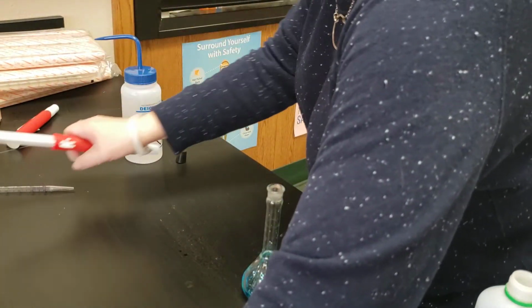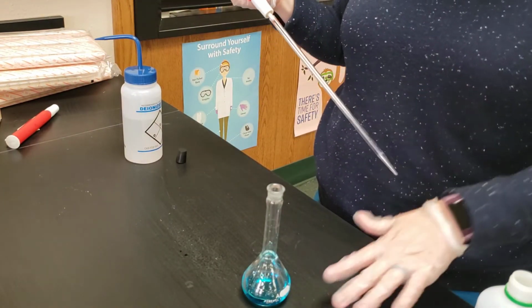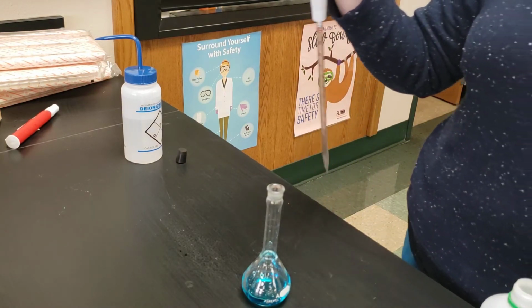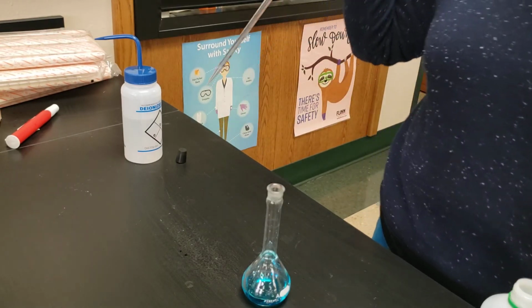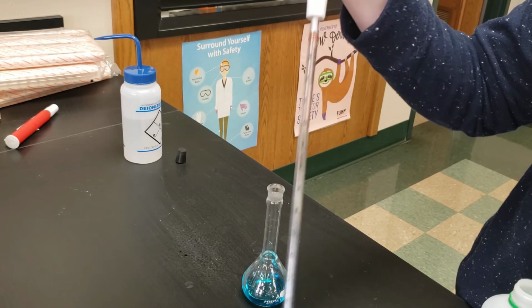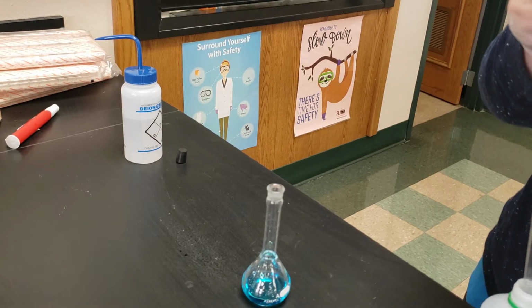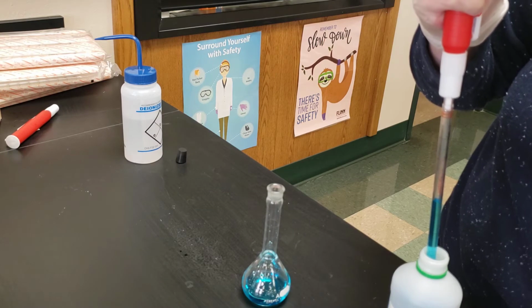So, the other thing I'm going to do, I need to get 40 milliliters total in here. So I'm going to roll my pipette filler down. Do not push these down. And then I'm going to use this type of pipette with the graduations on it, and I'm going to fill it up to the 10 milliliter line. And then repeat with the 5.